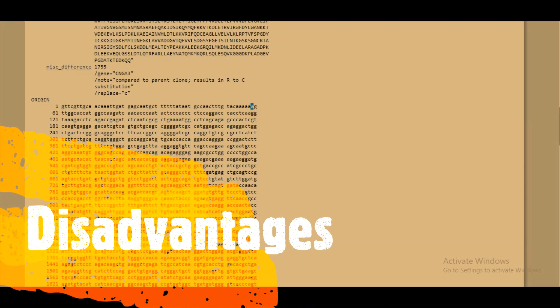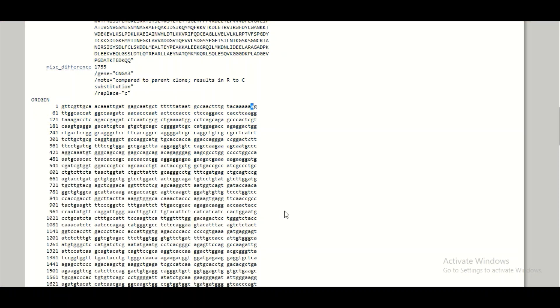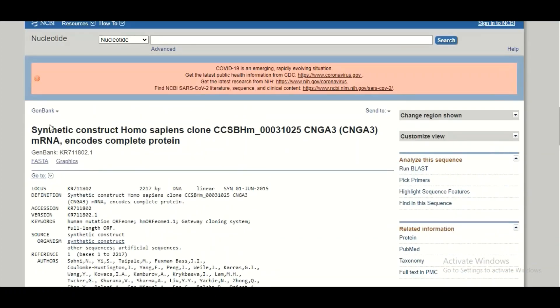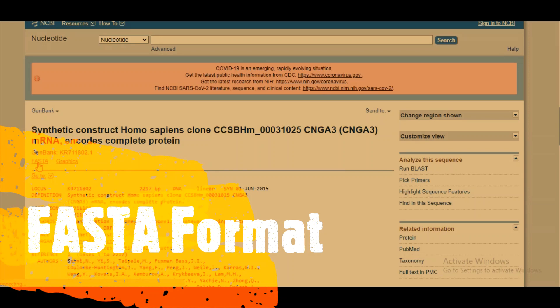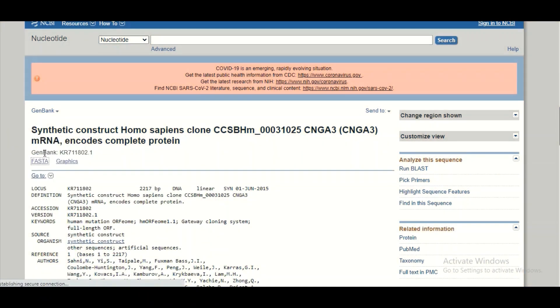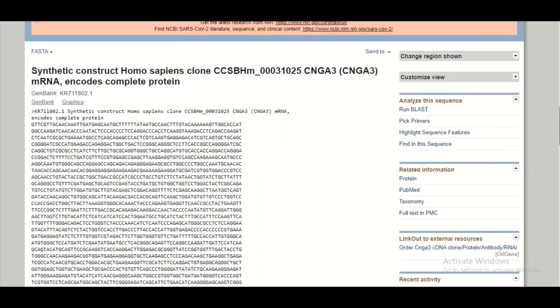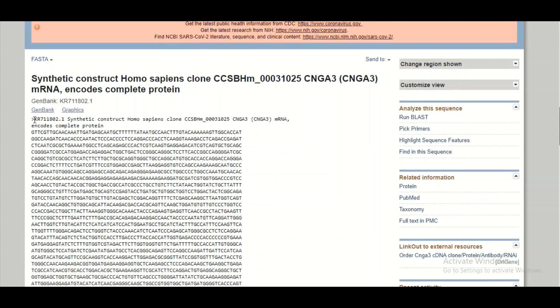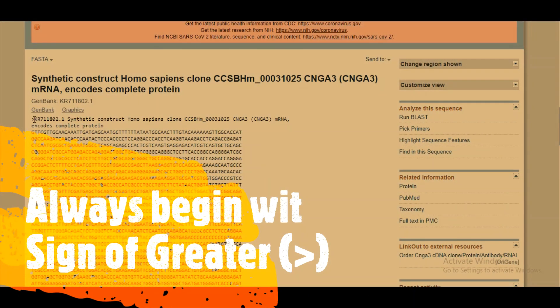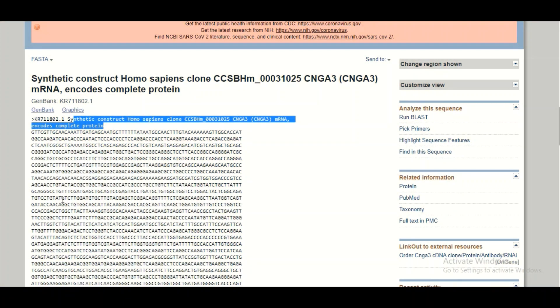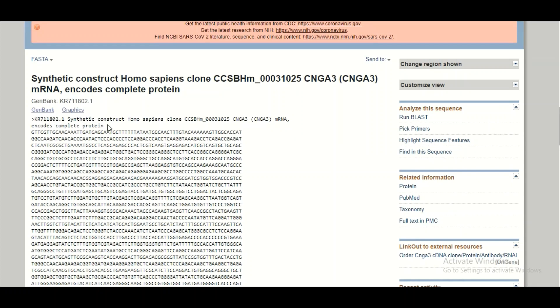One major disadvantage of GenBank format is that it cannot be directly used in bioinformatic analysis because it contains numbers and spaces, which are not acceptable in most tools. The sequence format normally used for bioinformatic analysis is FASTA. To get the FASTA sequence, go to the top of the page and click on 'FASTA.' You will be taken to a new page with the same sequence written in FASTA format, which always begins with a greater-than sign, followed by the accession number, definition, and then the sequence with no spaces or numbers.